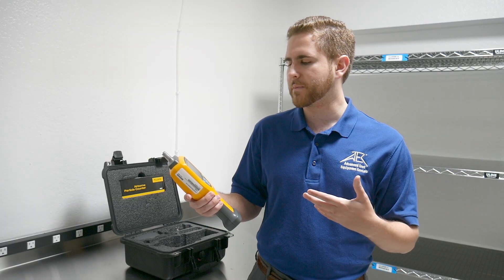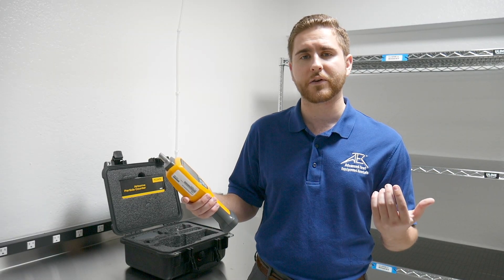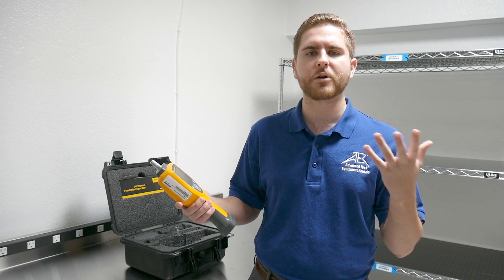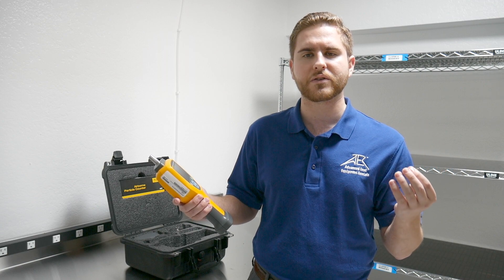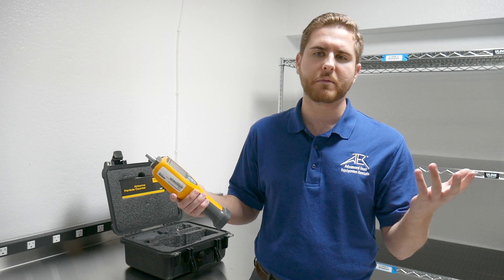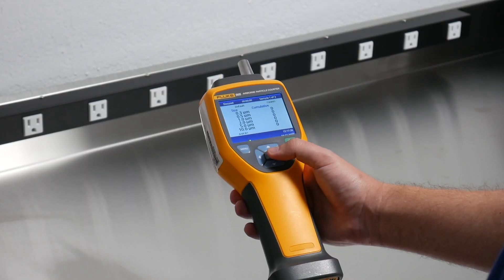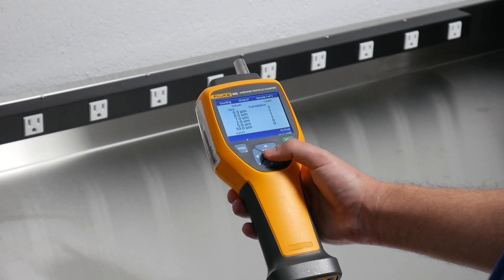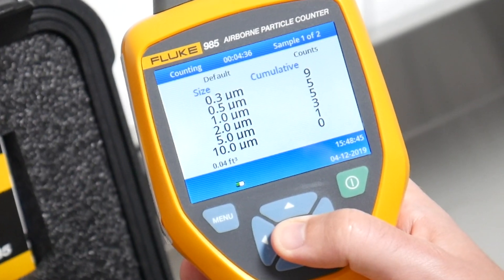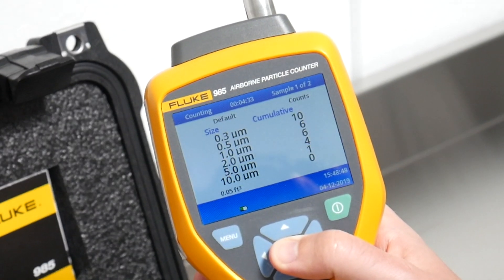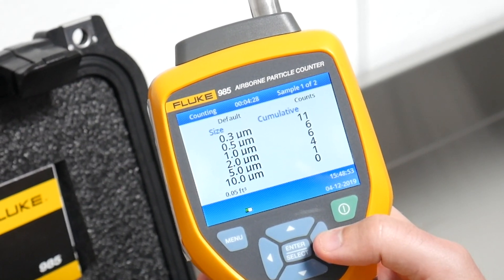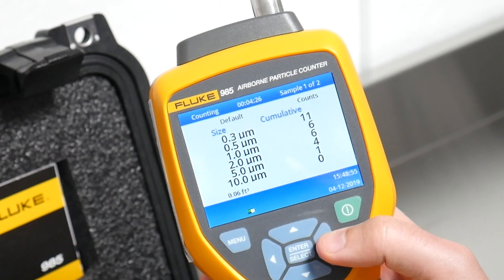Here we are in our clean room to take a sample with the Fluke 985 particle counter. Particle counters like the Fluke 985 are used in a clean room to ensure that air particle levels adhere to clean room classification standards like ISO 14644 and ISO 215014. Let's take our sample. As you can see, the particle count here in our clean room is far less than in an uncontrolled environment. You will even see lower particle levels in the clean rooms that are maintained and used by massive manufacturers.